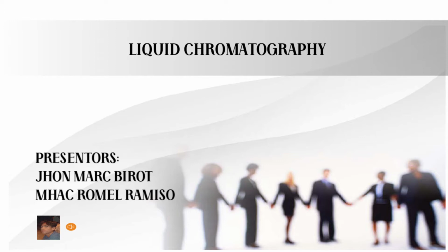Good day. Our topic for today is about liquid chromatography.